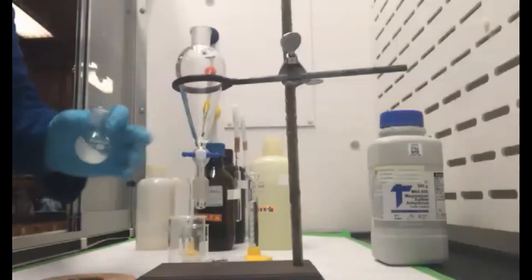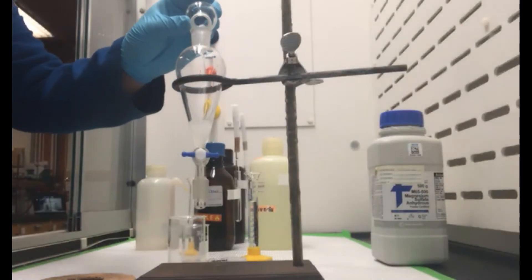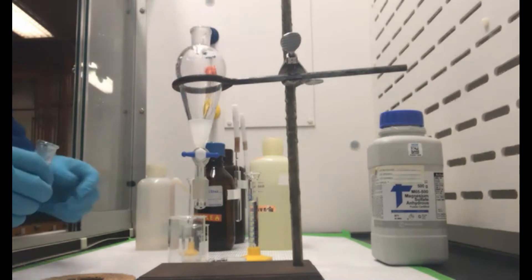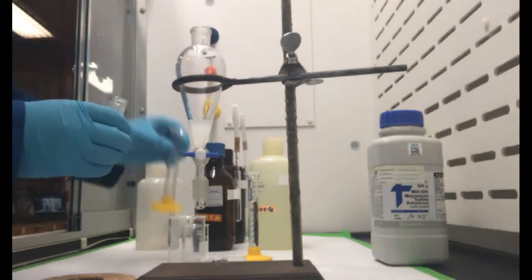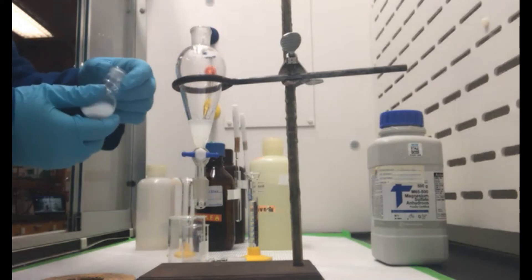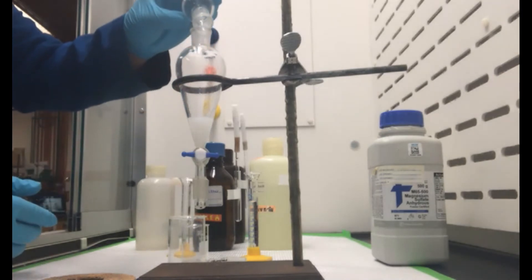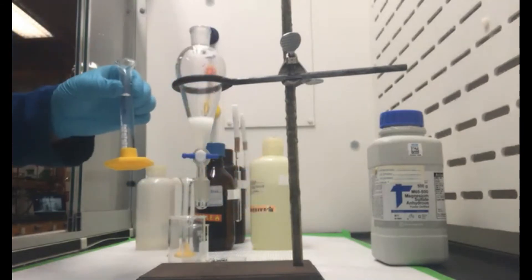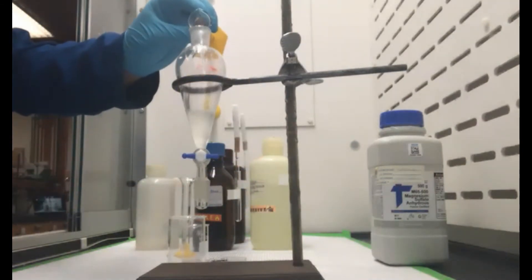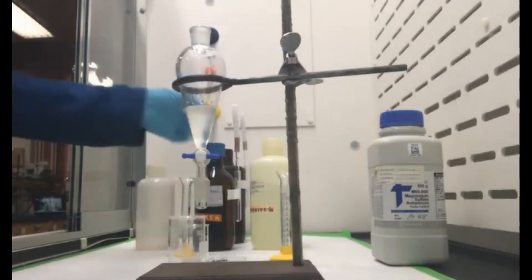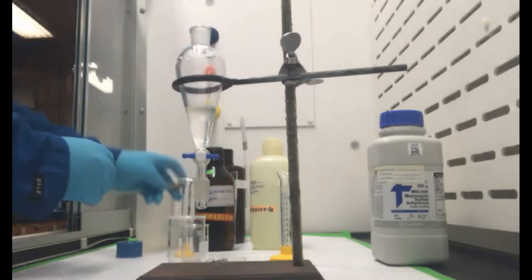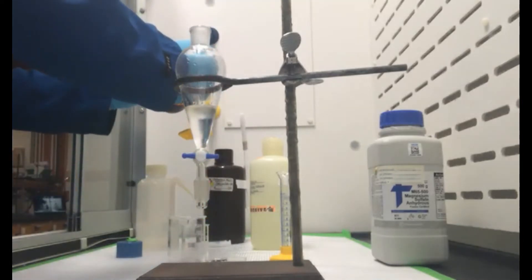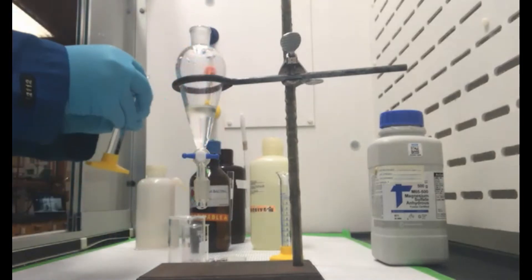So I have the product. I'm going to add that to the sep funnel. I'm going to add our crude mixture here. I'm also going to take that round bottom and just wash with a couple more mils. Wash with a couple mils of MTBE and we're going to add that. We can set that aside. And now to this, I am going to add some water. And then we're going to add just a little bit more MTBE for the extraction. Five mils of MTBE.